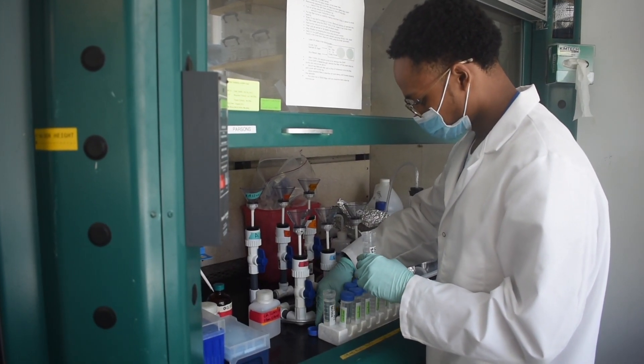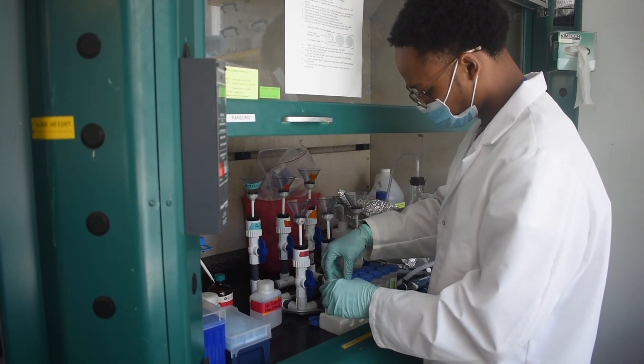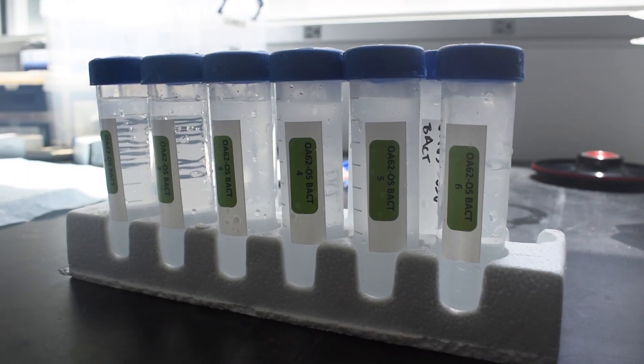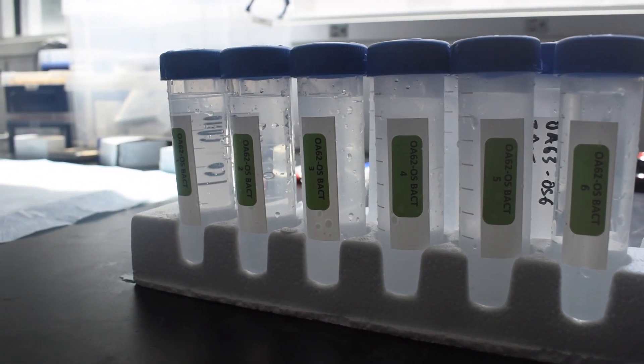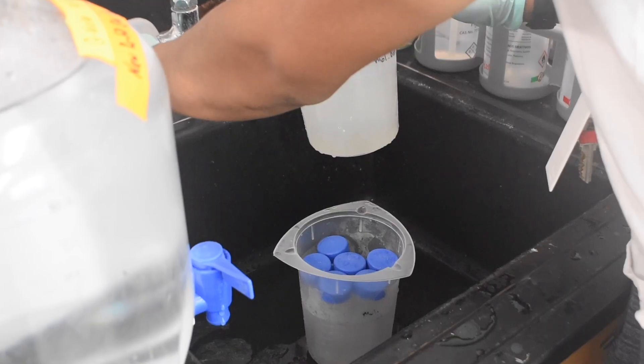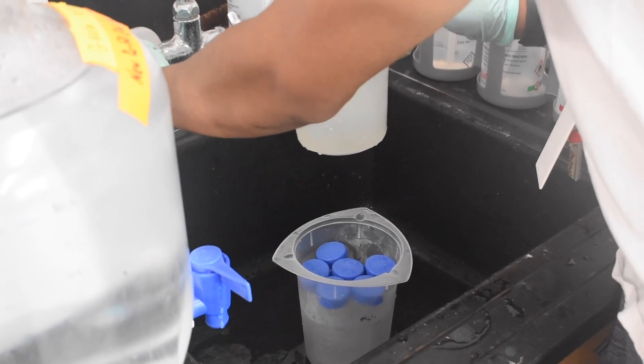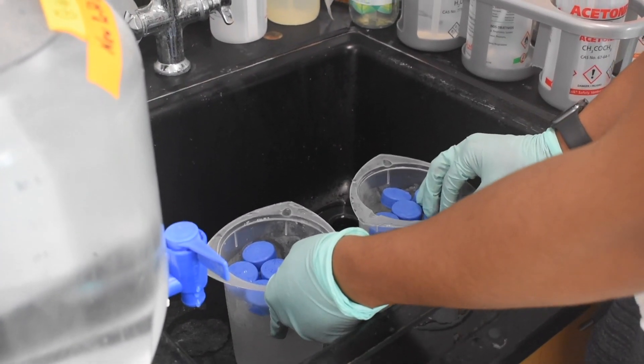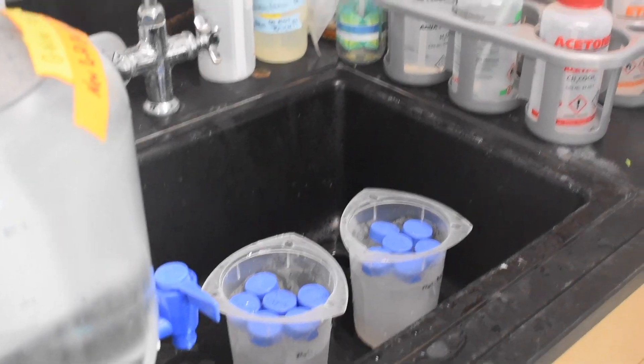So we start with samples and our samples are fixed with formalin, 10% formalin, for a couple of different analyses but for the actual bacteria enumeration we will filter the samples. They're stored at minus 80 so we need to thaw them and do a quick thaw so we do it in warm water.